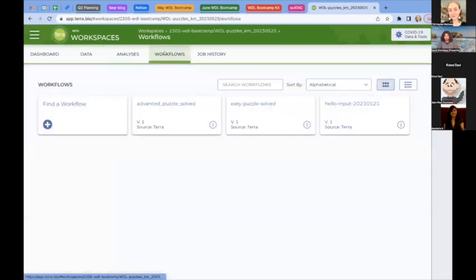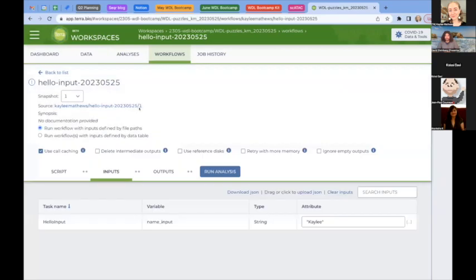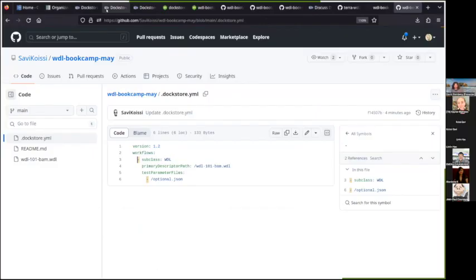Alternatively, you can go to where the workflow is. I think you can do it from this page actually. If you click on this, you can copy the workflow itself to another workspace as well. So you can go from either direction to get those into the same workspace if that's what you want to do. Yes, I see. Cool. I think the way to do it is to go via the data and add it to the workspace, but I see both ways work. Thank you. No problem.